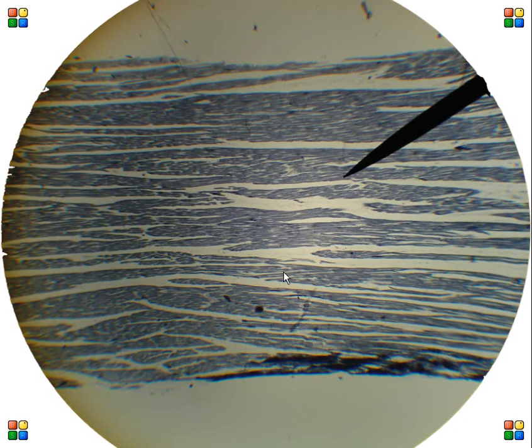This is cardiac muscle. And you can tell it's cardiac muscle because we don't see those nice long tubes that we saw with skeletal muscle. Instead the cells are shorter and they're branched.